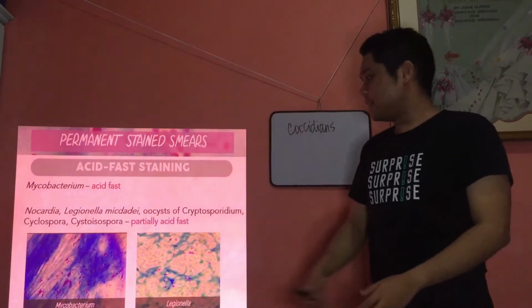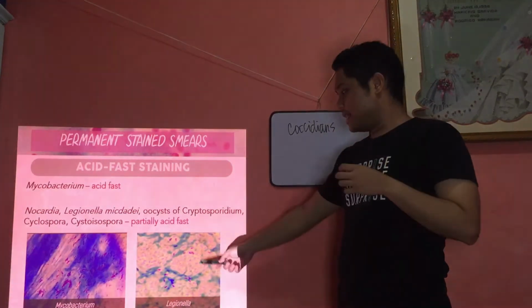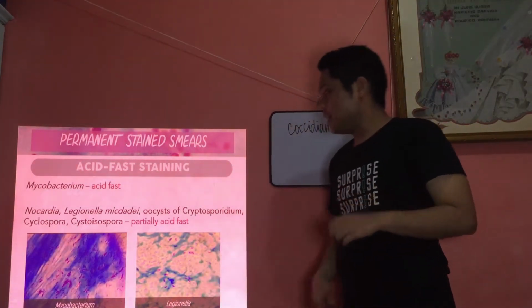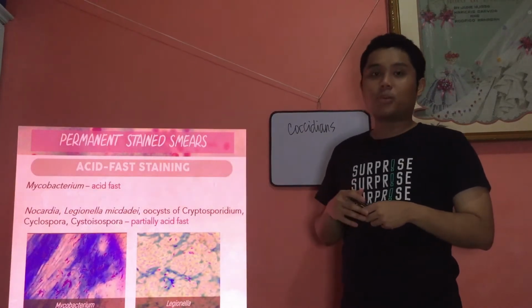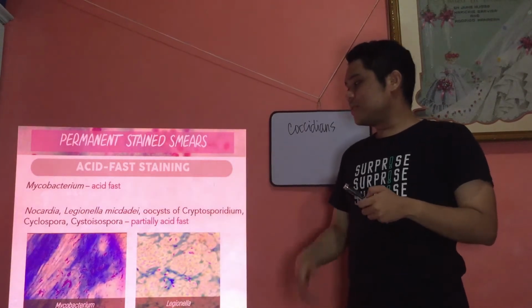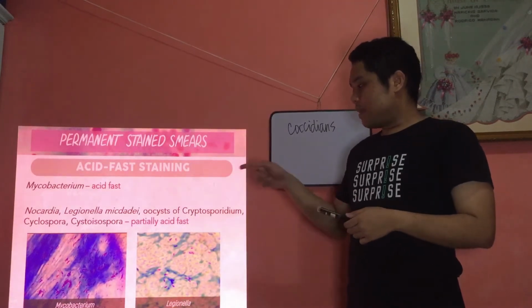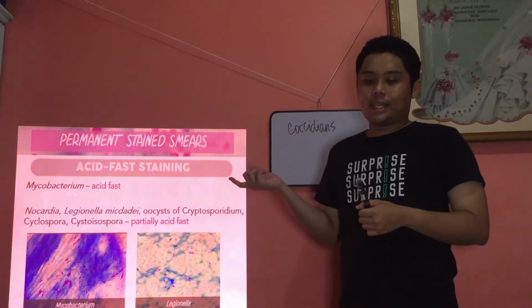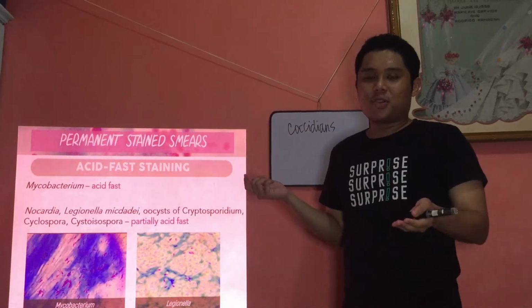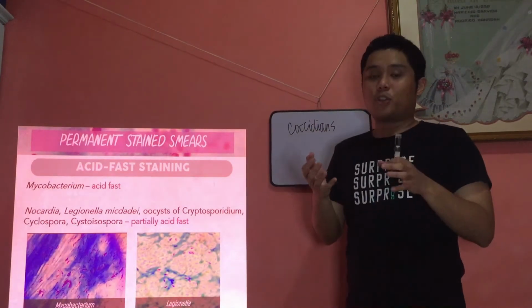So the red ones are your Mycobacterium tuberculosis. And these are your Legionella micdadei, as you can see. It's much less red compared to your Mycobacterium tuberculosis. This picture, guys, is from a real sample. When I was an intern in Galeares, I was able to capture this result in our microbiology, when I was assigned to microbiology, when they were examining acid-fast slides for tuberculosis.